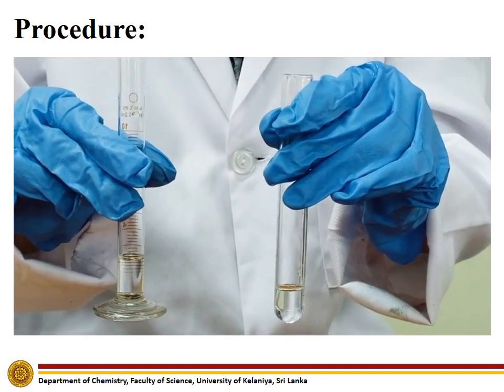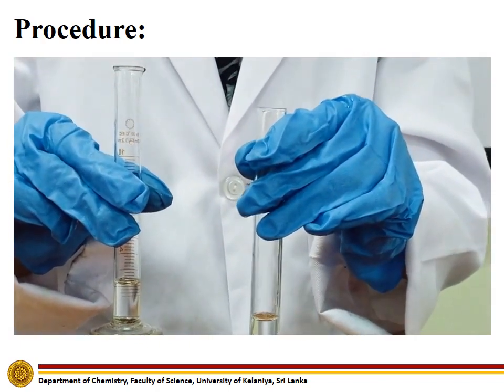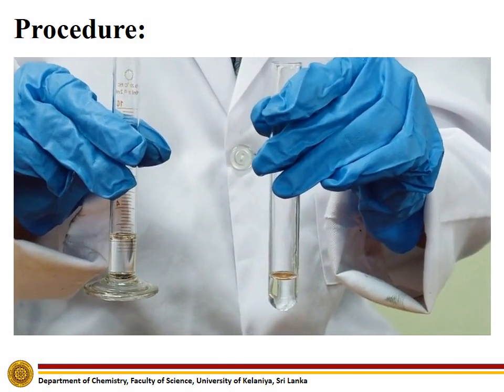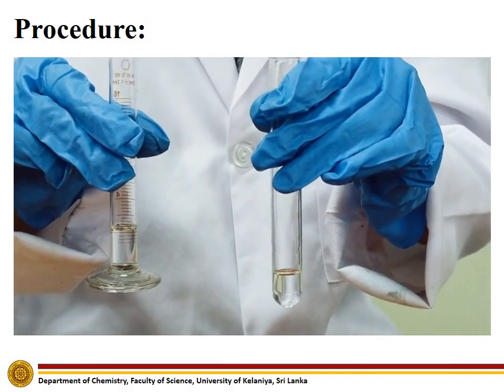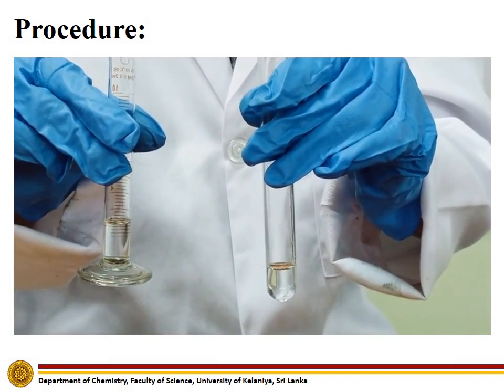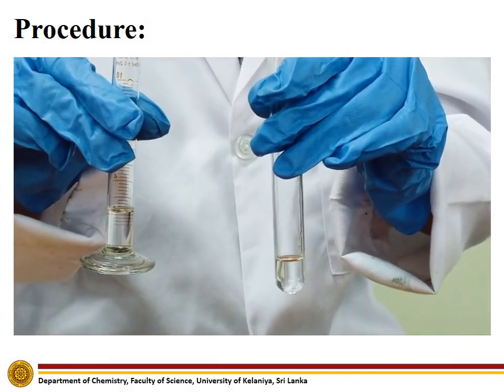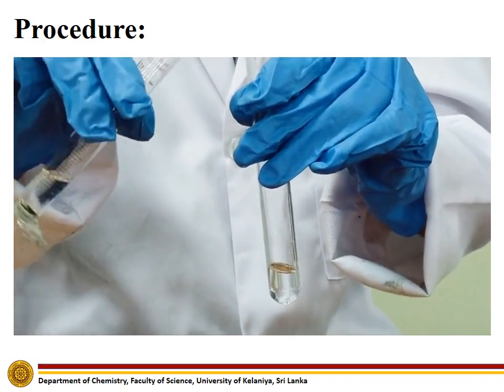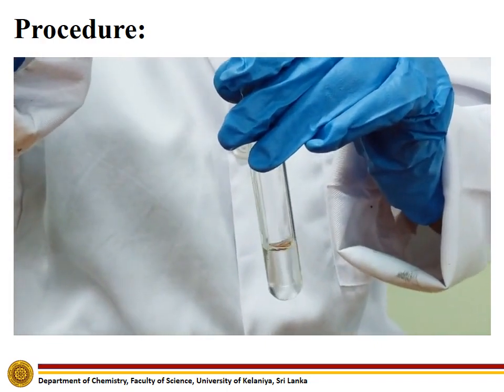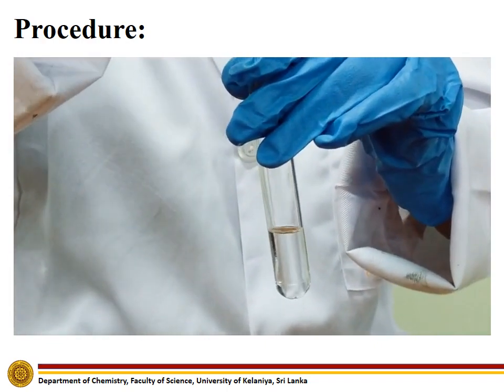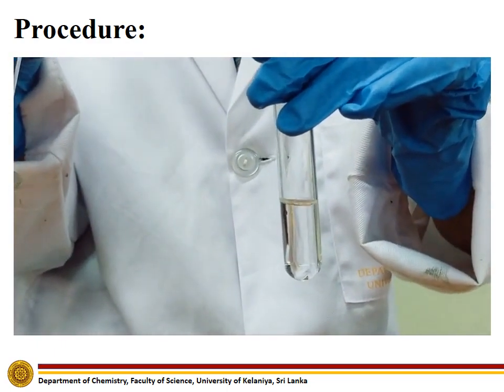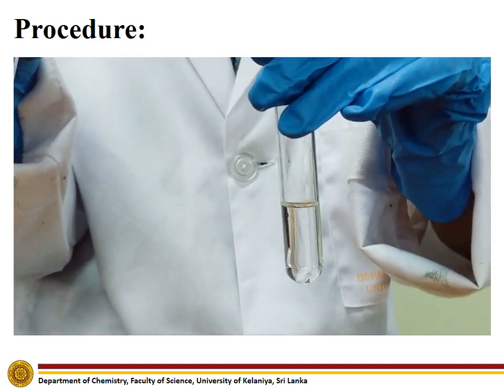To carry out the second experiment, mix the carboxylic acid with 2 ml of dilute sodium hydroxide solution and observe whether a clear solution is obtained. A clear solution can be seen.